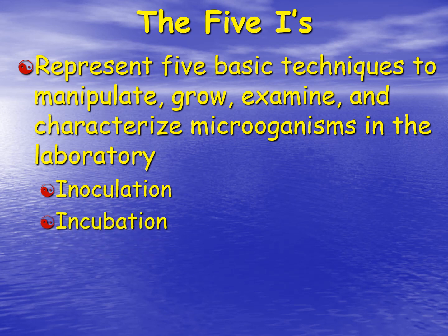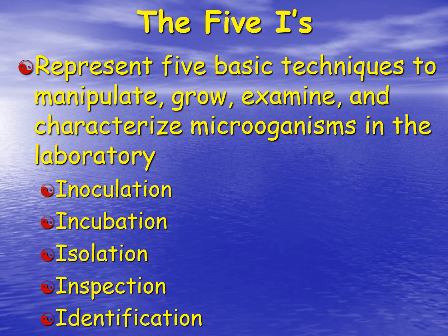Incubation is where you allow time for these organisms to grow, and we can grow them at various temperatures. Isolation is where we're going to actually isolate a single entity or a single organism from a colony. Inspection, we're going to look at the different characteristics of the organism, and those should all lead then to identification of the organism.